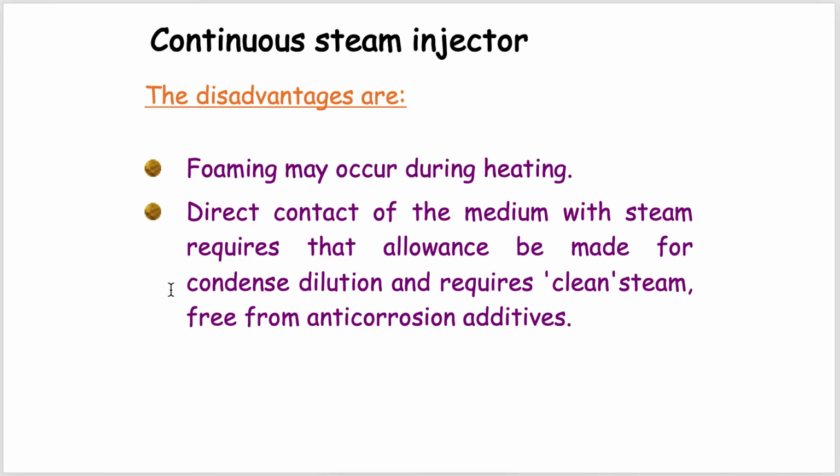Now, the disadvantages of the continuous steam injector. Foaming may occur during heating, and direct contact of media with the steam requires that allowance be made for condensed dilution and requires clean steam free from anti-corrosion additives. The steam will definitely be sterile, but the steam should also be clean. It should not contain any unwanted particles.